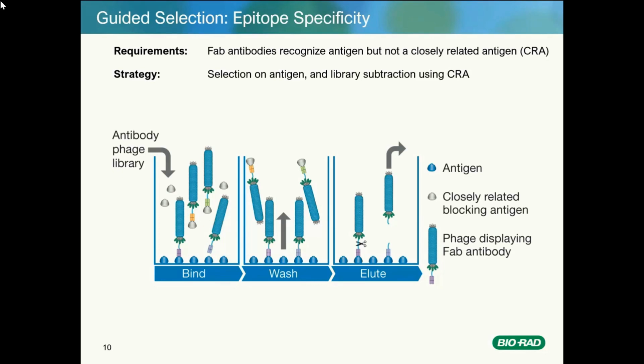The antibody-carrying phages that specifically bind to the antigen are eluted with reducing agent in the CysDisplay technology, and the enriched phage is amplified and subjected to 2 more rounds of panning.